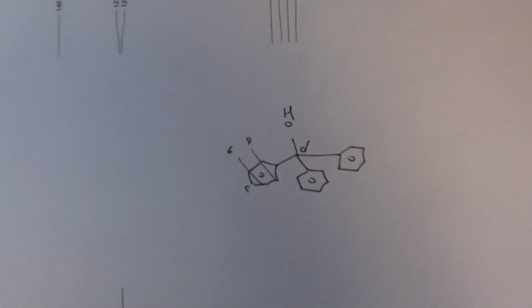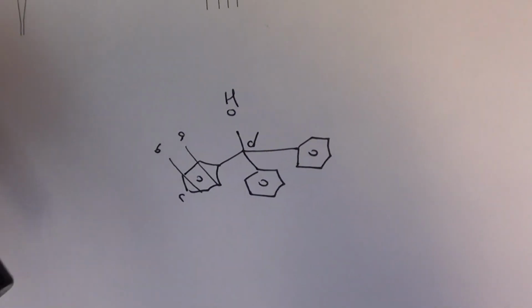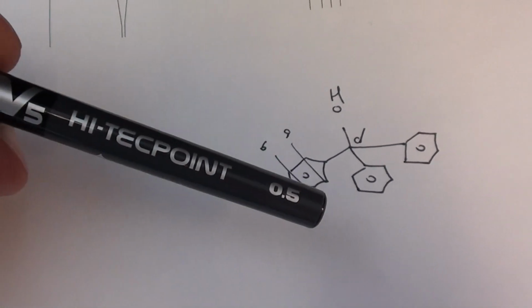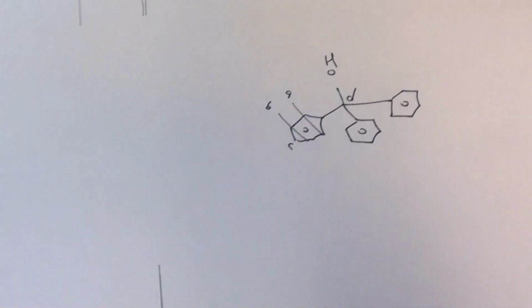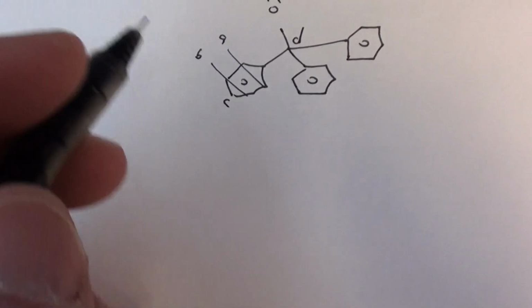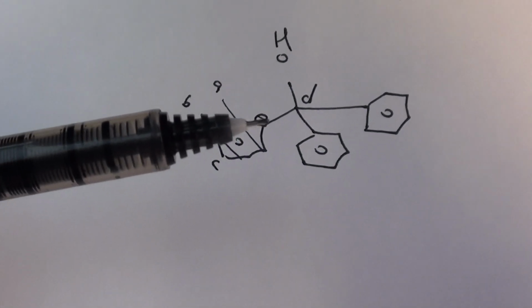If we move on, and we already looked at this one, the C13 of your starting material. Now what I've done this time around is I've double checked a few things when I was marking. This is one of the ways I labeled it. I've done it in class where you see your two ortho carbons. And I've just forgotten one, haven't I? If I went A, B, C, D, then obviously I'd have to label this one as E. And I'd have to go over here and I'd label this one as F. So we're good. Okay. So we expect to see the attachment carbon that I've labeled E.